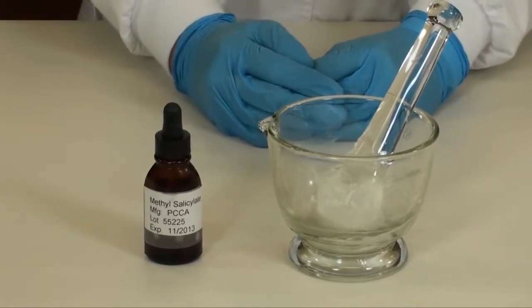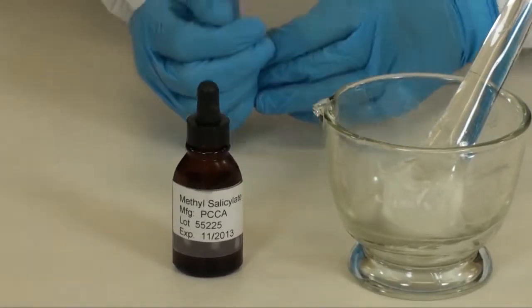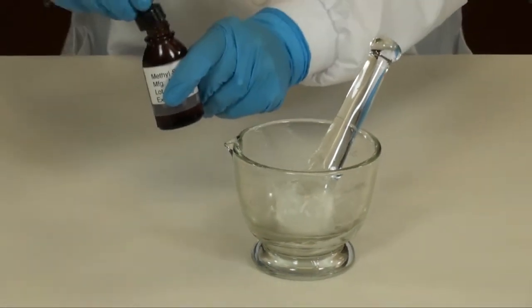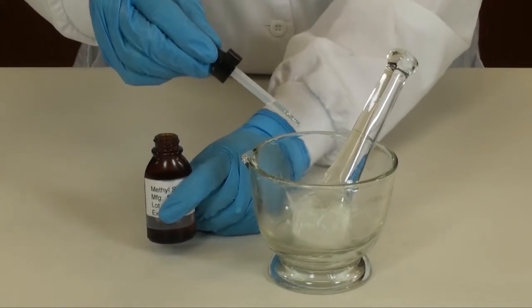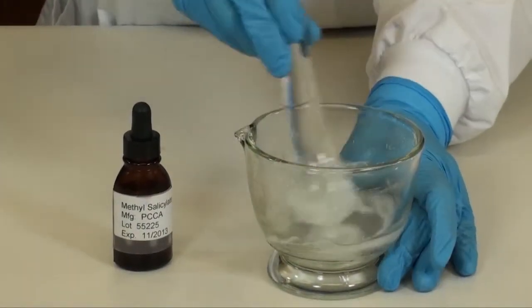To cover the camphor smell, we need to go ahead and scent our product with methyl salicylate. Add several drops, keeping track of how many drops you add, and then triturate.